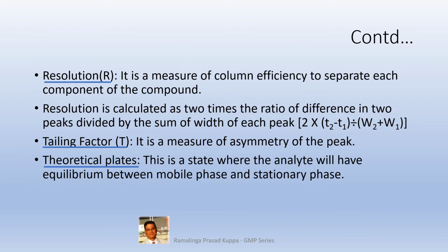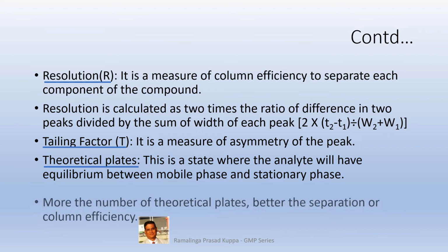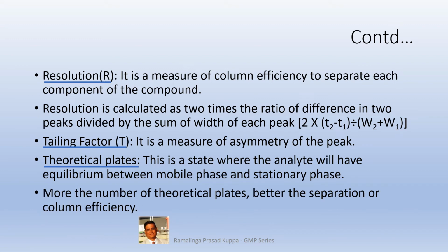The movement of the analyte is assumed to be from one plate to the other as a series of equilibrated mobile phase plugs. At each plate, there is equilibrium between stationary phase and mobile phase for analyte. So, the greater the number of such plates, the more efficient is the separation power of the column.